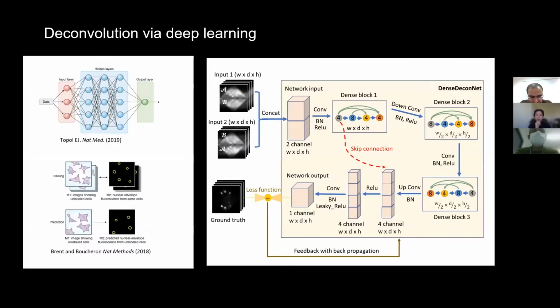Now, deep learning has been getting a lot of buzz lately, but of course the idea goes back to the 50s, right? Where you had these perceptrons, and the idea is if you have your data and some feature you want to learn about, if there is a statistical mapping between the data and the output, the thing you want, stacking these nonlinear filters together and using gradient descent and backpropagation gives you a very efficient way of learning this mapping.